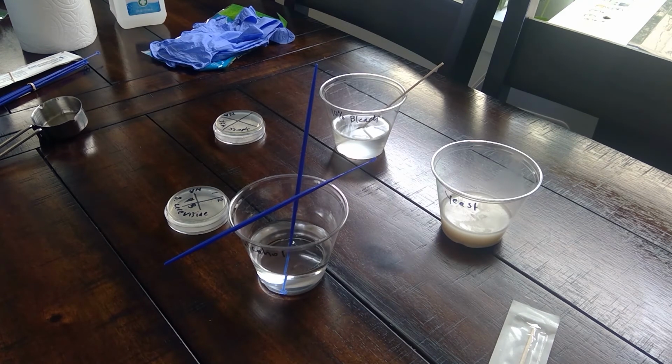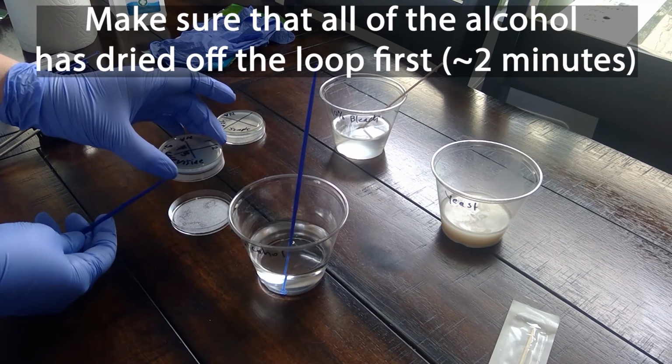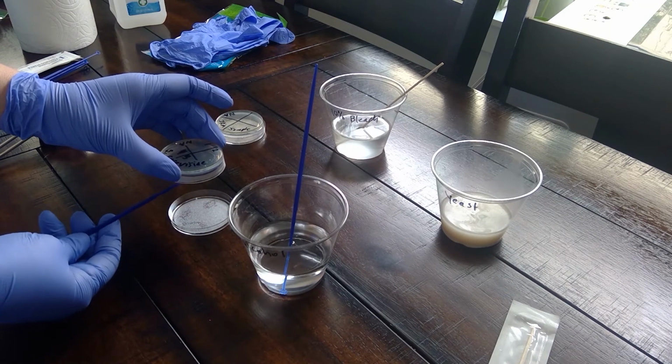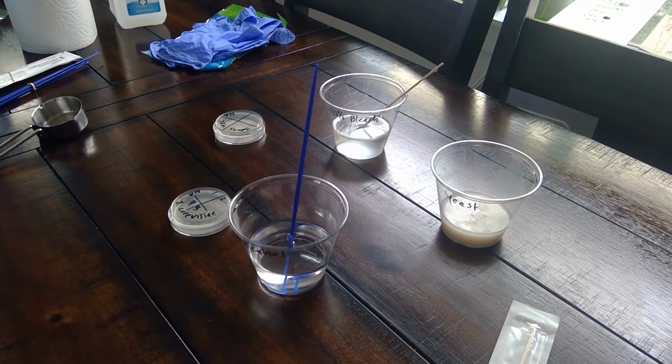So then we're at step 16. Open the lid of the S. cerevisiae agar plate and touch the loop to the edge of the inoculated quadrant and transfer microbes to the adjacent quadrant of the plate. So we'll want to transfer from quadrant 1 into quadrant 2 in a zigzag pattern. And then we'll stick this back into the alcohol.